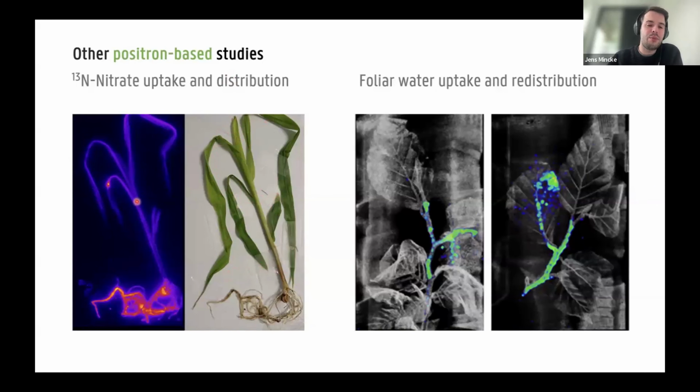Unfortunately, we also performed PET imaging, but like I said, the positrons that are emitted by nitrogen-13 have a long positron range, and the biggest part left the leaf, so it did not contribute to the PET image. So the stem was also put into the PET scanner for 1 hour, but hardly anything was visible because of the positron range.